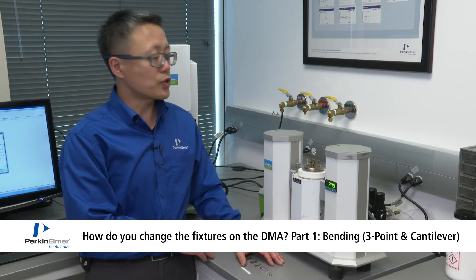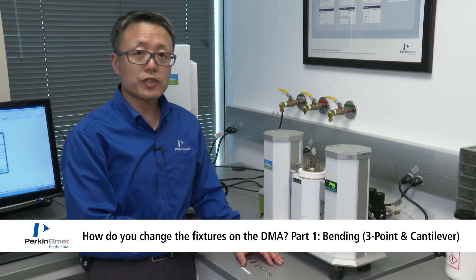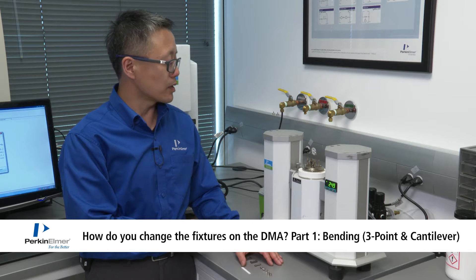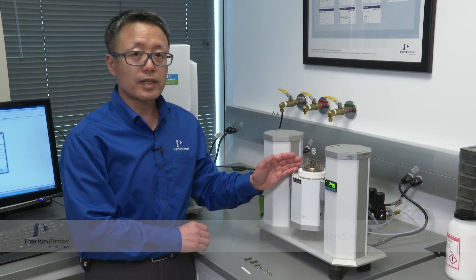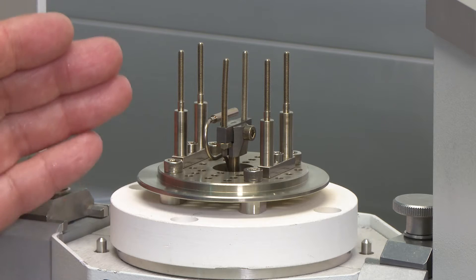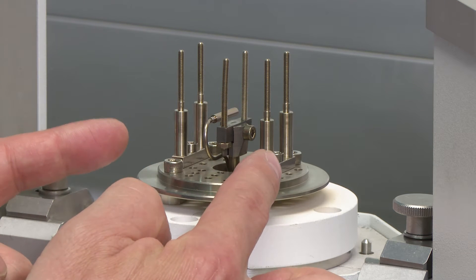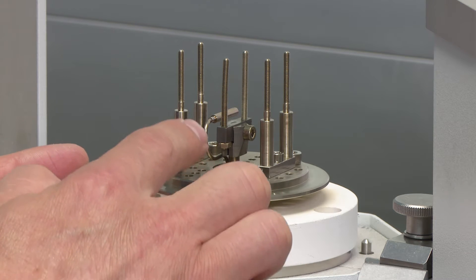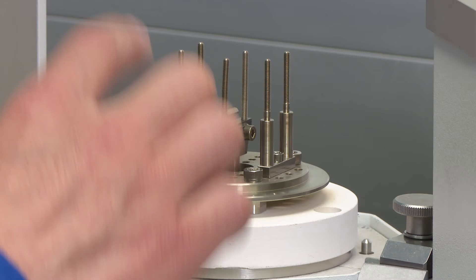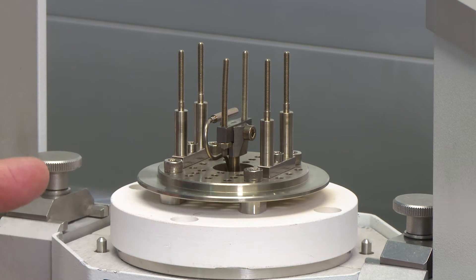This video is going to show you how to change fixtures on the DMA8000 model. This is the sample area. It has two fixed pillars and a moving probe connected to the LVDT inside the DMA.